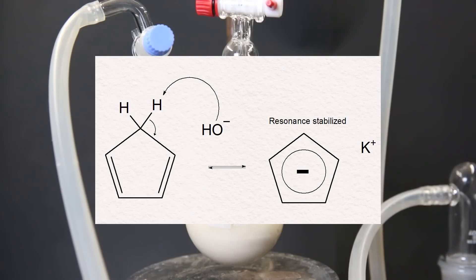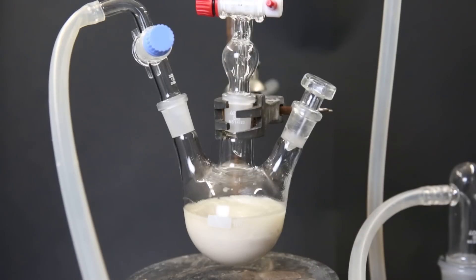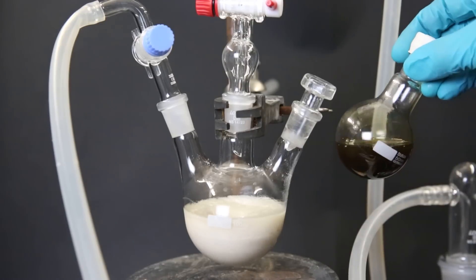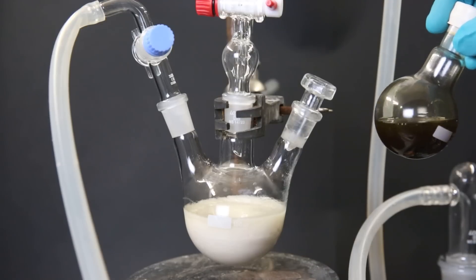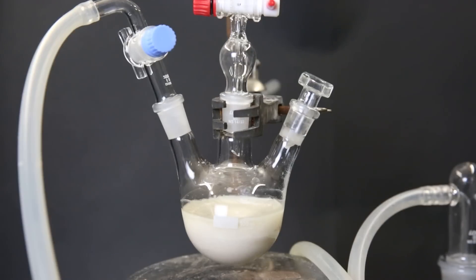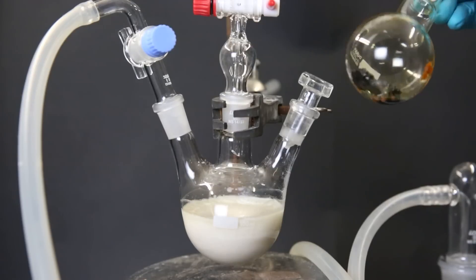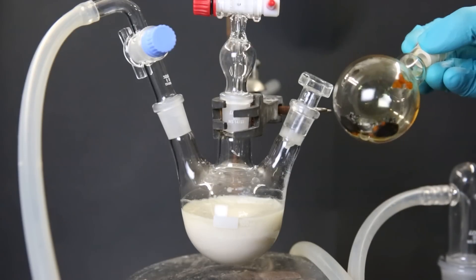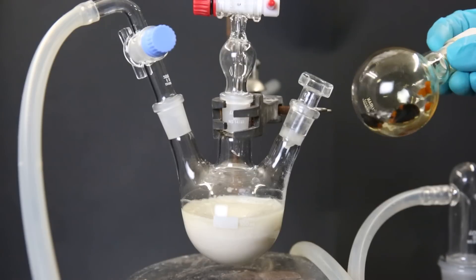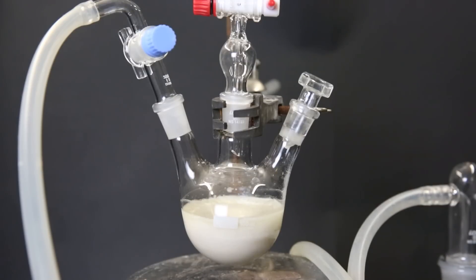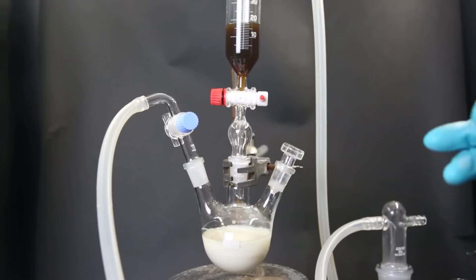So now that most of the iron has reacted with the iron(III) chloride, and we have a solution of iron(II) chloride, I can now add it to the dropping funnel under argon flow. After adding all of the iron(II) chloride solution, there are still some iron powder and iron(III) chloride left that hasn't reacted. But since it was added in excess, it doesn't really matter. So now that the setup is complete and the reactants are ready, I can start the reaction.